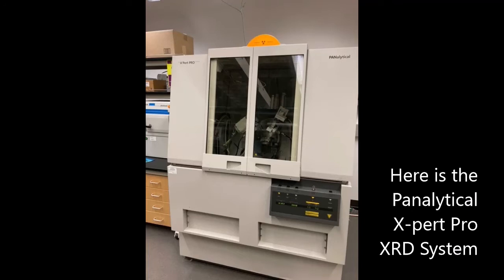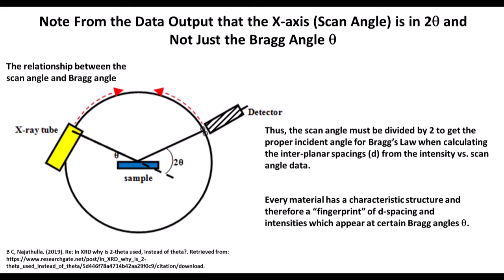Here we show the actual diffraction unit that we will be using in this lab experiment. The sample is fixed in a horizontal plane, and the X-ray source or the X-ray tube moves in a clockwise direction around what we refer to as the focusing circle, and the detector moves around that focusing circle in a counterclockwise direction.